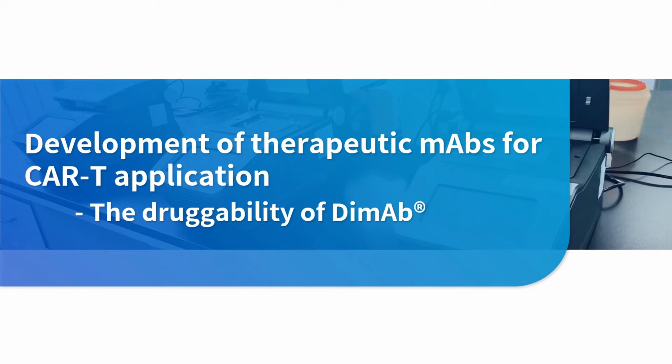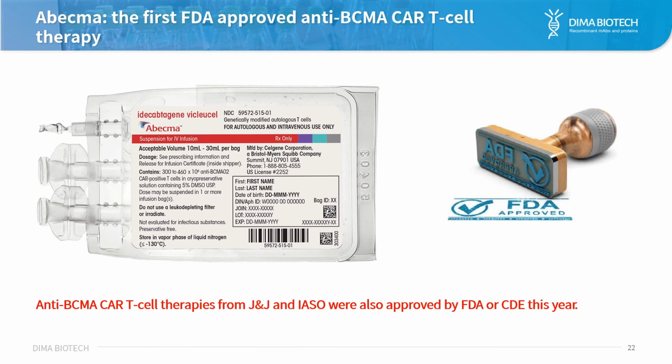Now I would like to showcase one example that we collaborate with a biopharma CAR-T company. We develop good therapeutic antibodies and CAR construct and use that for the clinical trials. First, let's go through the background of the target BCMA.